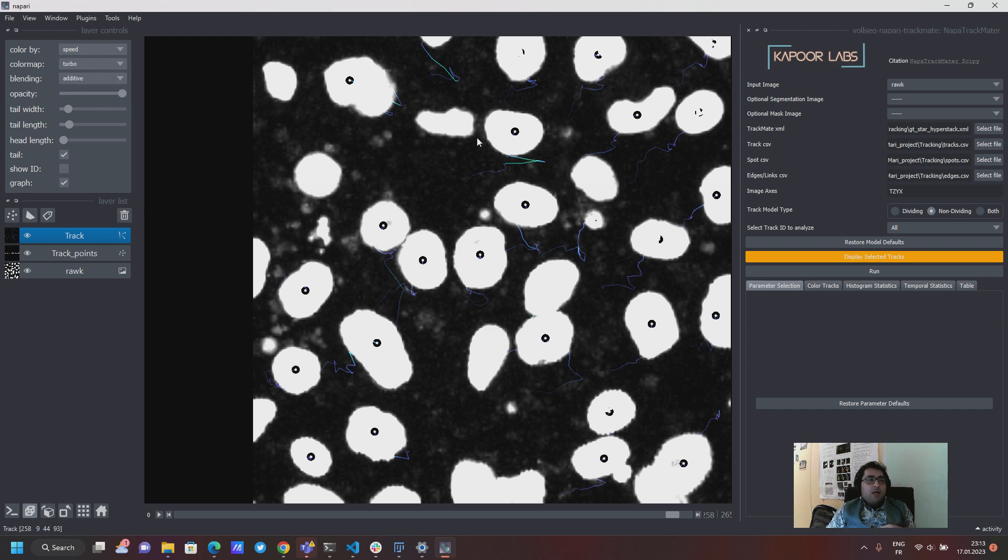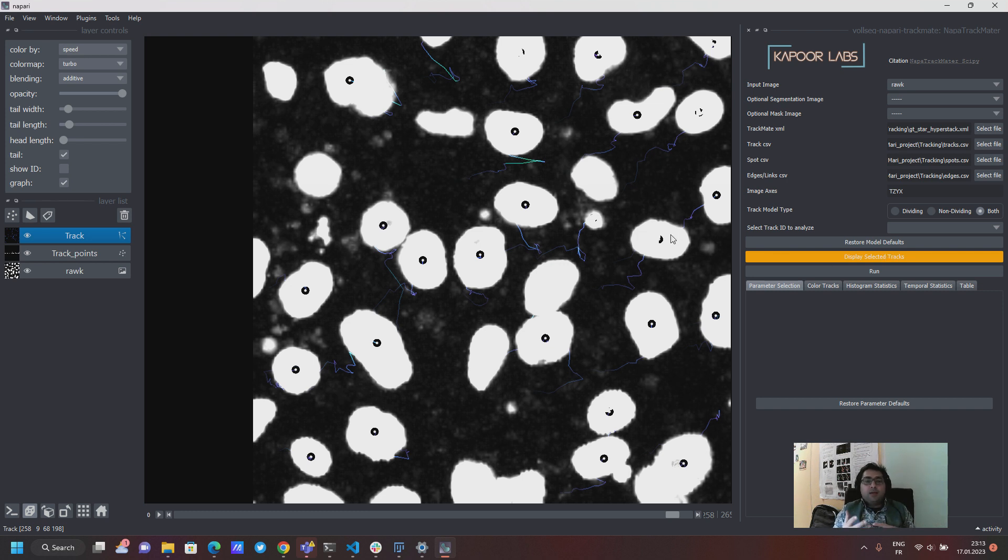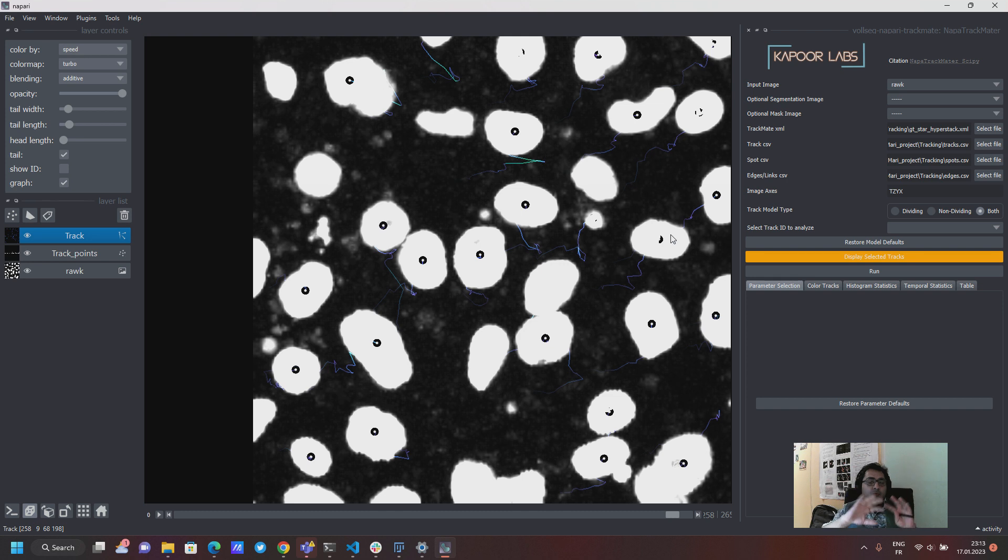So using this now if I say I want to see both of the tracks like both the dividing and the non-dividing at the same time, it will actually take all of the tracks which are in your experiments and then you would be able to visualize this at the same time.